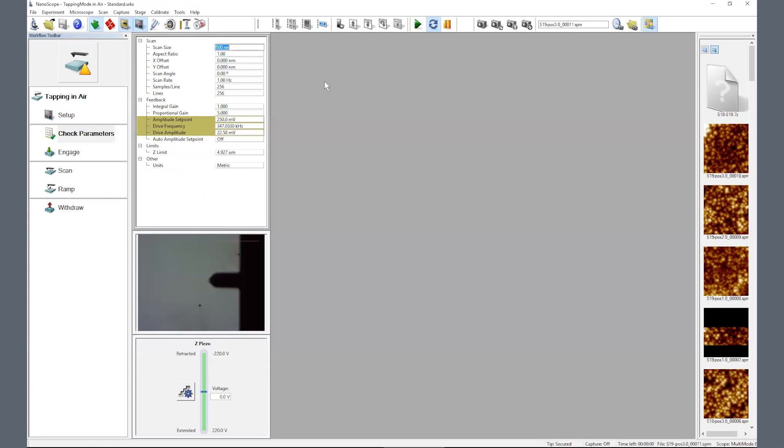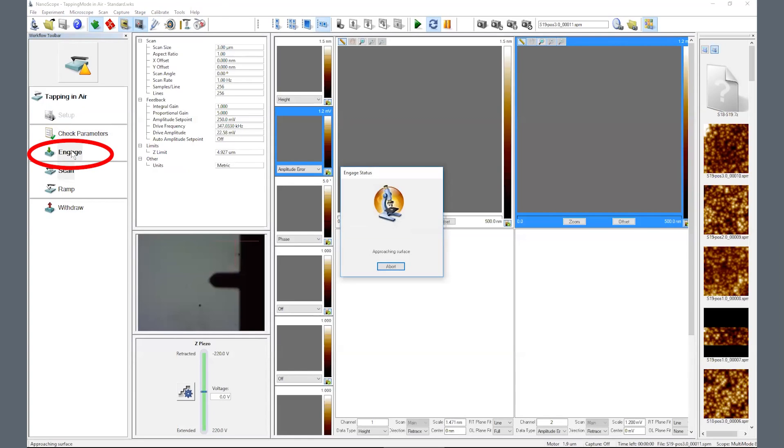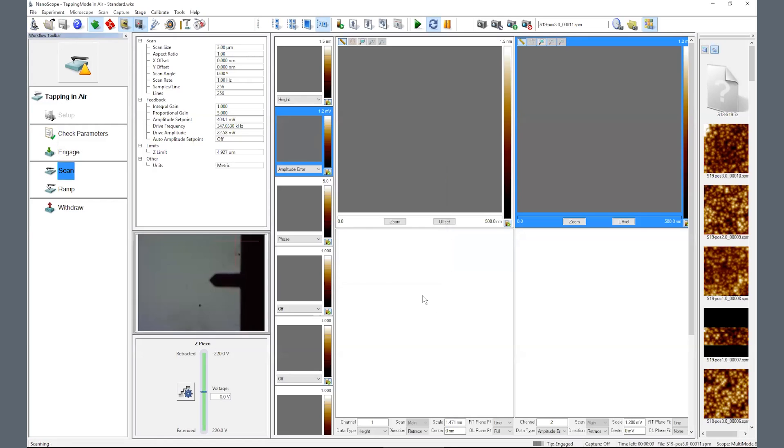Click on check parameters on the workflow toolbar. Set your desired starting scan size and click on engage at the workflow toolbar. The head motor takes over to slowly lower the probe. Once the probe senses the surface, it will automatically briefly contact the surface and begin scanning left to right.